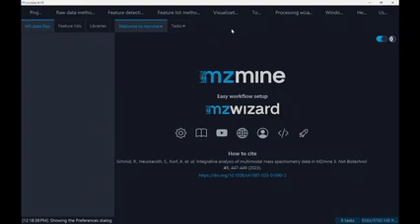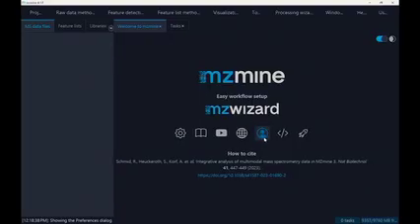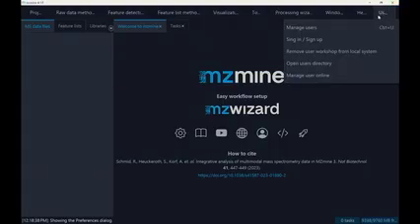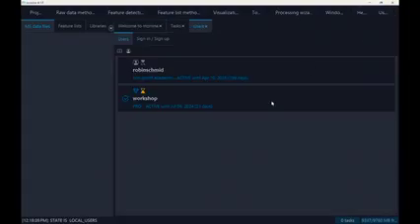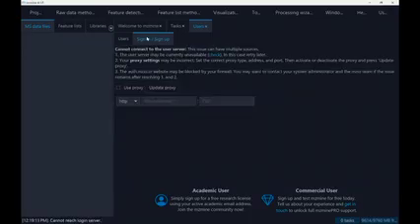Otherwise, just follow along. The first thing that we have to do is click on the user icon here, or on the top there is users, and then manage users. In here, you can click on sign in or sign up. This might already be coming up on your side.